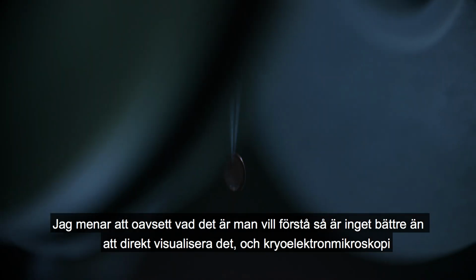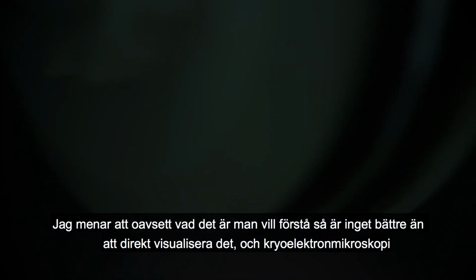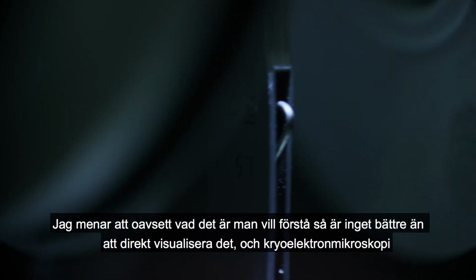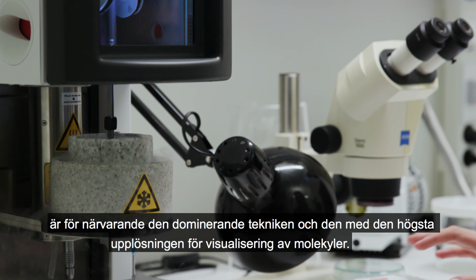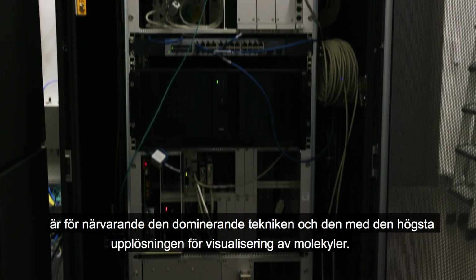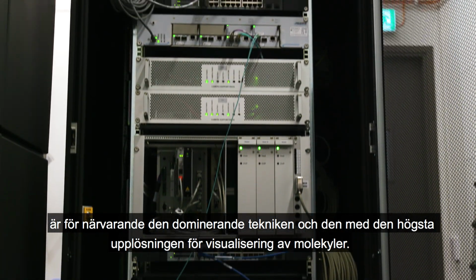I think for any process that you want to understand, there is no better way than to directly visualize it. And cryo-EM at the moment is the most dominant technique and the highest resolution technique that allows visualization of molecules.